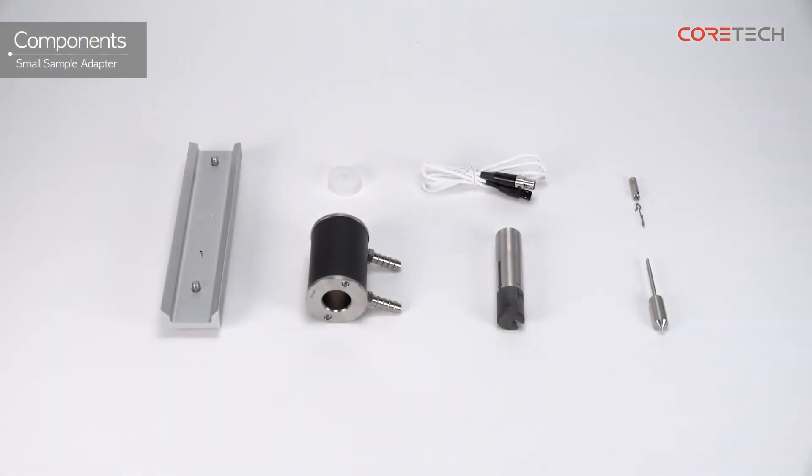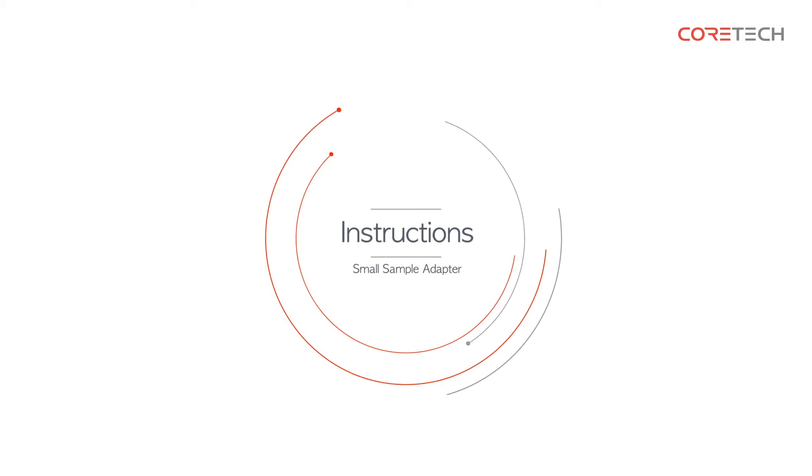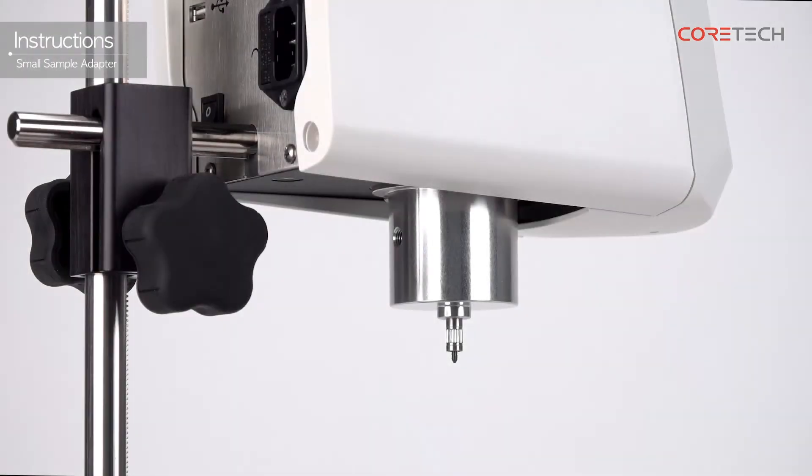The components of the small sample adapter are as follows. Today, we will explain the model used with the DV2T viscometer.